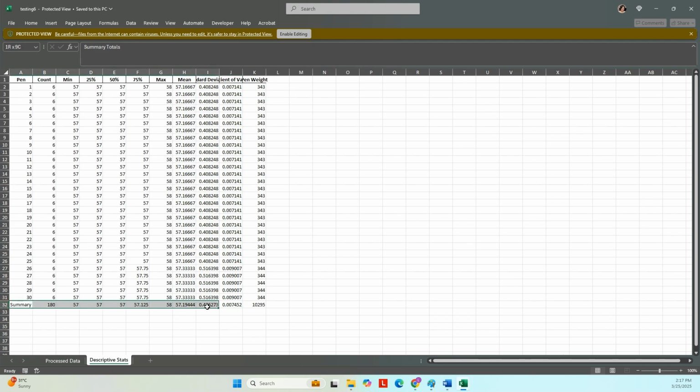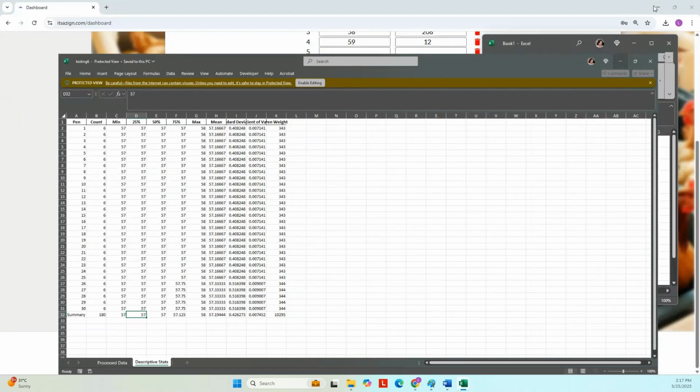The very last row just contains an overall summary of all the experimental units that were allocated, the minimal and maximal, and the mean and the average of all the statistic parameters of my entire allocation process. And that's it.